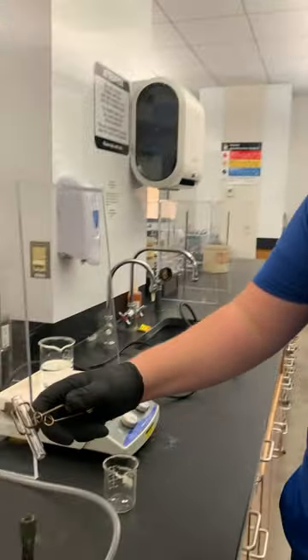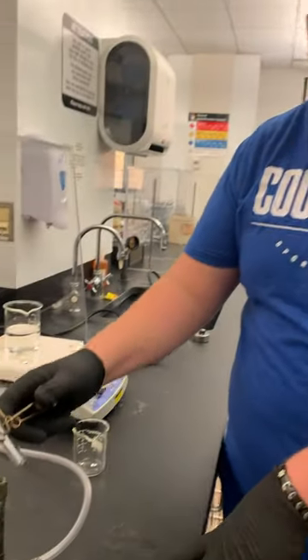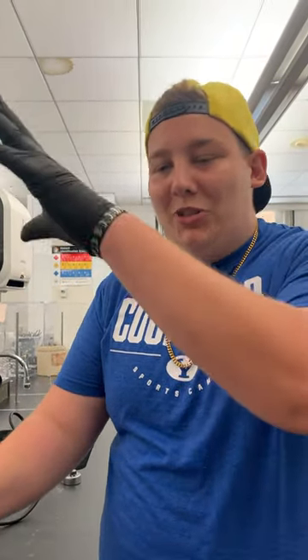For heating up the test tube on the Bunsen burner, you just want to move it slowly and evenly over the flame so it doesn't get too heated up at any one spot. Once you're done, you want to make sure it's plenty away from you, your lab partners, and anyone else, in case the chemical spits out.